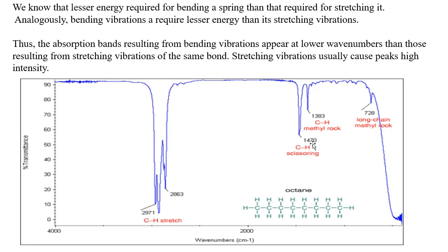You can see these are the bending vibrations in octane. It is the IR spectrum of the molecule octane, C8H18.